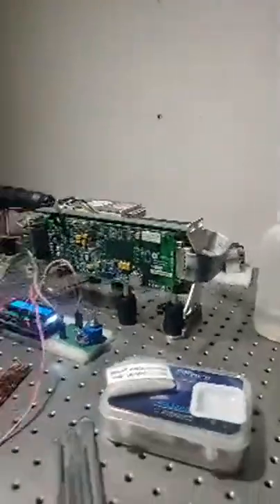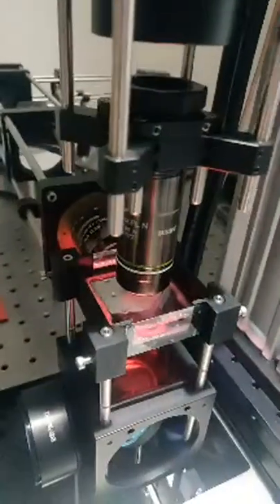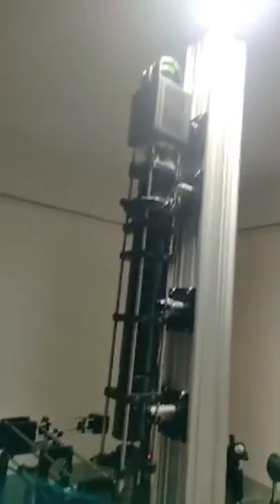So we have a laser there. That box is the laser, and the light then passes through here, this way. There are two mirrors. It gets bounced off them, enters this and then goes here. These are lenses, so they focus the light. And in this black box here, we have a tiny larval zebrafish under the lens. The light goes into the brain of the zebrafish, and then whatever emitted light there is will move into the detection path, and we have a camera here, which will take the images.